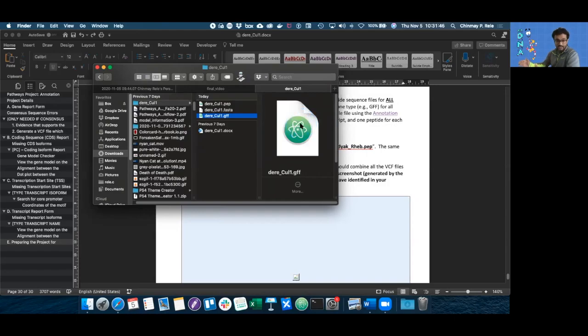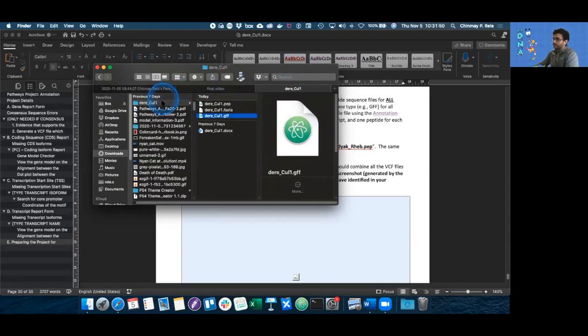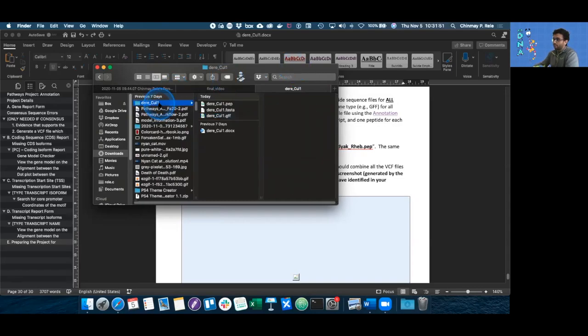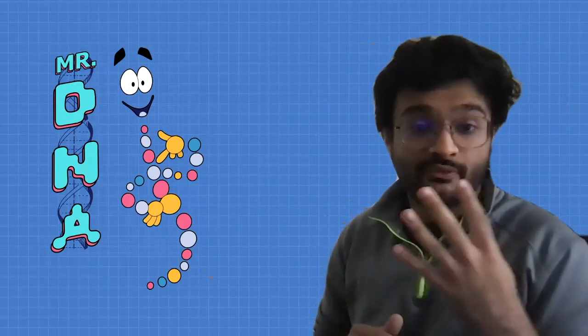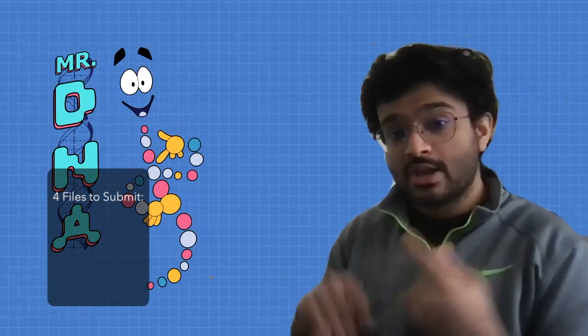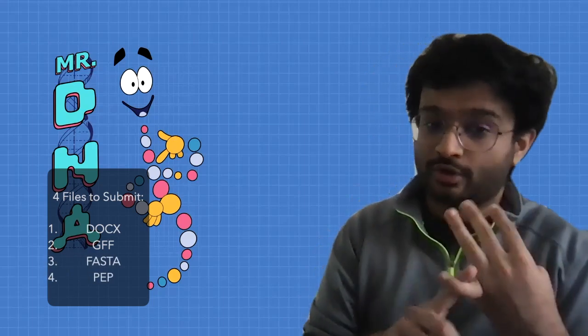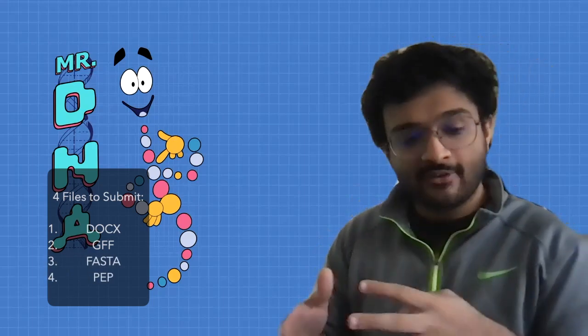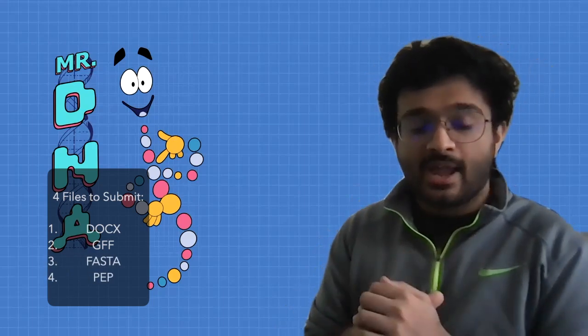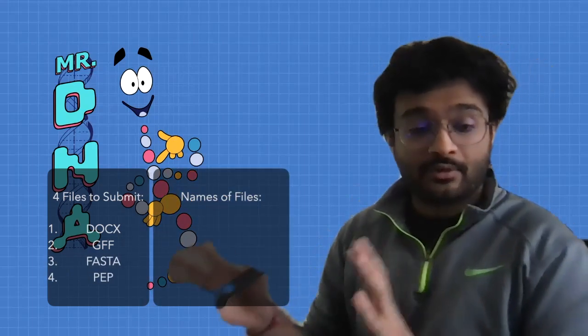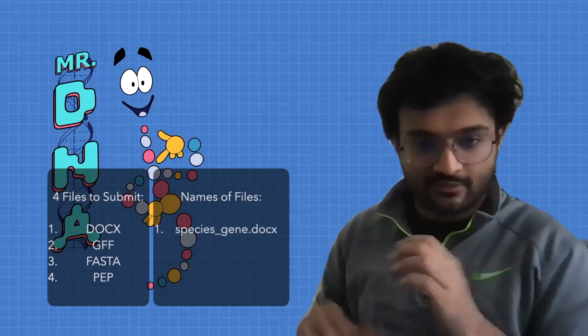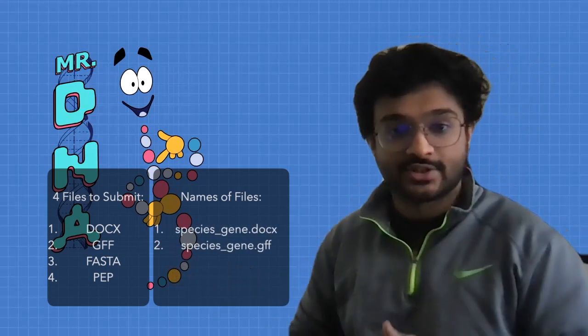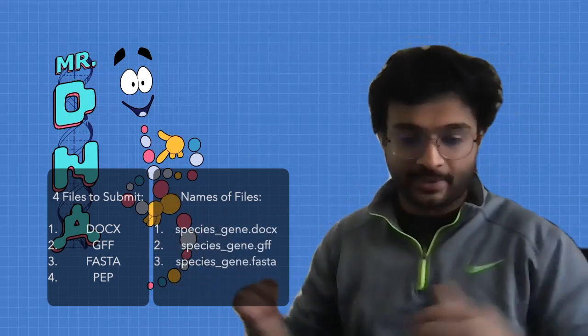And that's literally it. You're done. The only thing left to do is submit either the folder or the files within the folder to your faculty instructor. So there's four files which you need to submit to your faculty: the FASTA, the peptide, the GFF, as well as the Word doc or the PDF, and then your faculty will curate them and give them to us to do the analysis holistically.